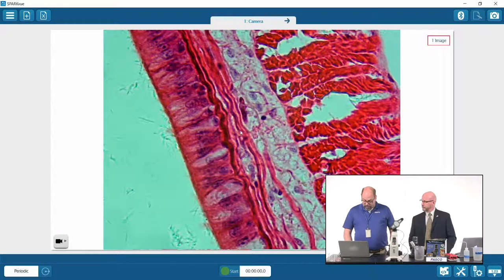This is an earthworm. If you take a look, we can see the side of the earthworm itself. We're getting a cross section. Of course, there's not much to earthworms, so you've got the outer skin, the inner skin that has a lot of the absorption capability. But if we look at this, we don't see a lot other than maybe a central little circle. Here's another one. That's a good example of the nucleus. Here's some skin cells there, epithelial cells that have a center, and you can see that there's some genetic material in there.